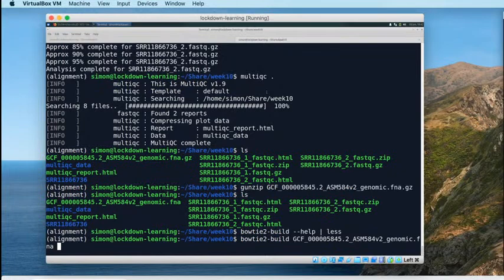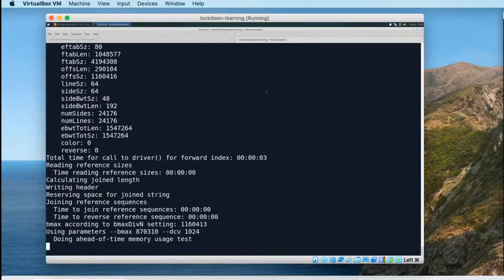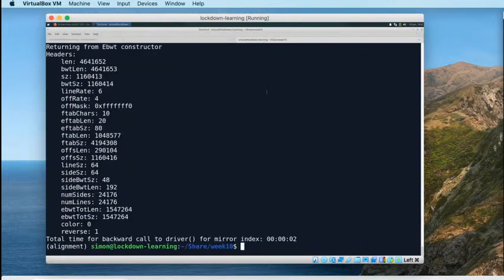And then the second argument was a prefix for Bowtie to write the resulting index files into, and I'm going to call our index here E. coli underscore K12. Okay, so that is my prefix for writing out my index. So I'm going to run this. While I run it, I'm going to answer Bernard's question about trimming. So off it goes. It shouldn't take very long actually, but it's going to splurge a load of stuff to the screen. While that's running, can you rescue an experiment by quality trimming if the experiment was not perfectly performed? My plan to do this while Bowtie2 build was running is scuppered by the fact that it's finished in 2 seconds, but never mind.